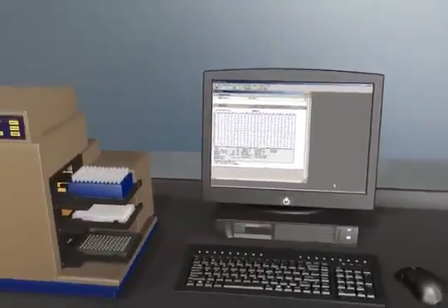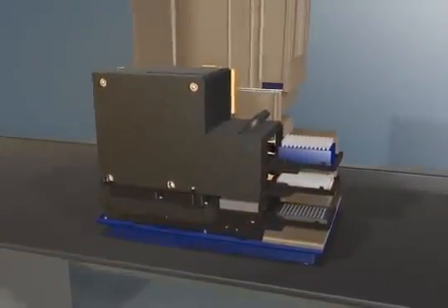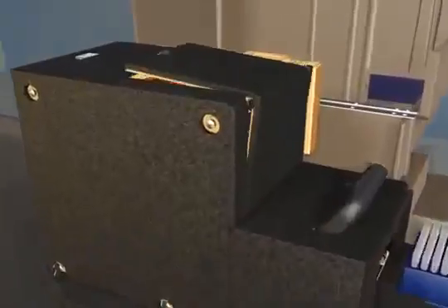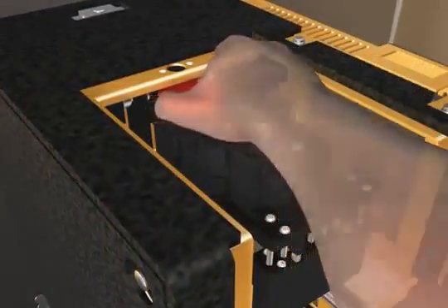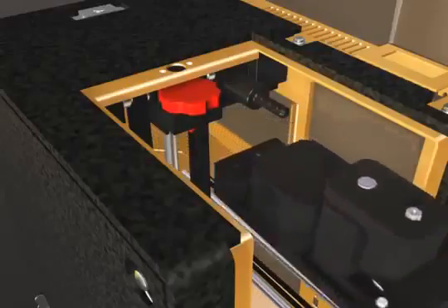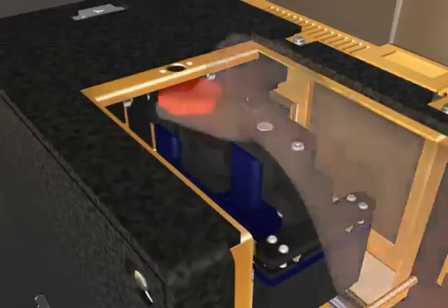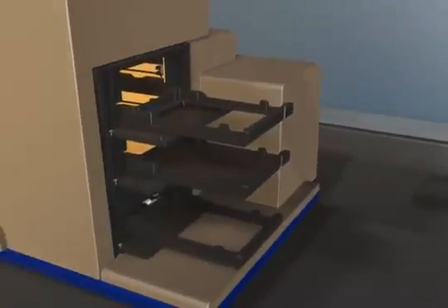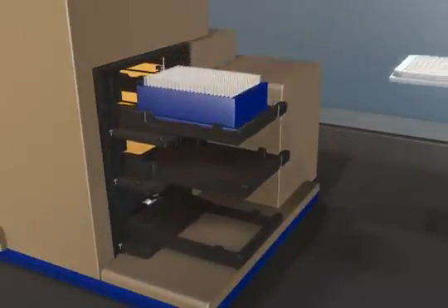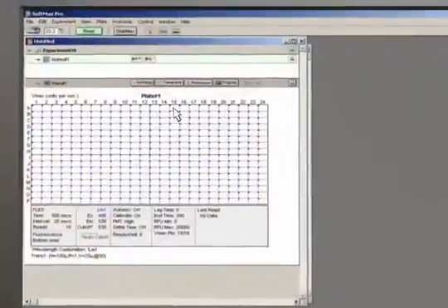To improve assay quality and increase throughput, the FlexStation3 system offers automated pipetting using a pipetter head with 8 or 16 channels. The pipetter head is user interchangeable, so you can switch between 8-channel and 16-channel pipetting as your throughput needs change. To run an assay with fluidics, simply load tips, a compound plate, and your assay plate, then click Read in the SoftMax Pro software.